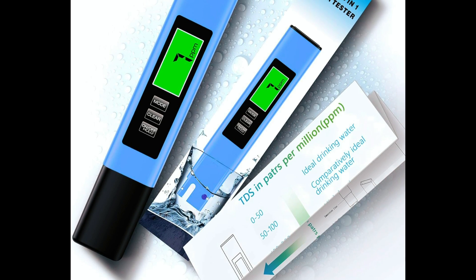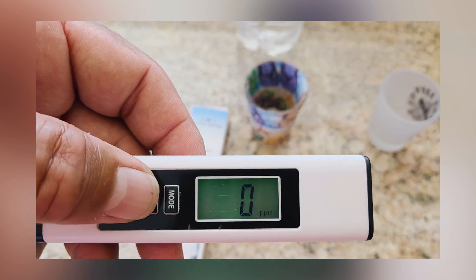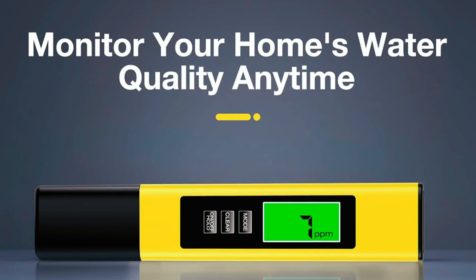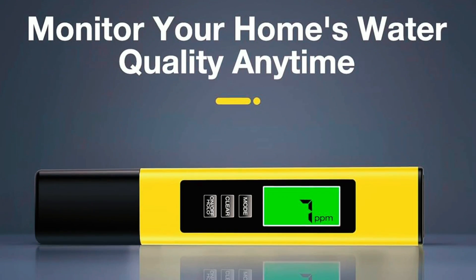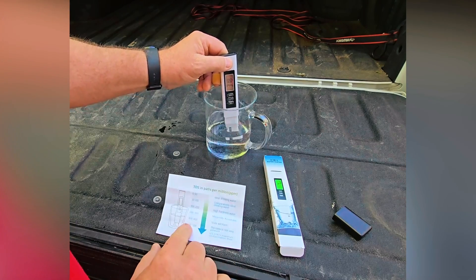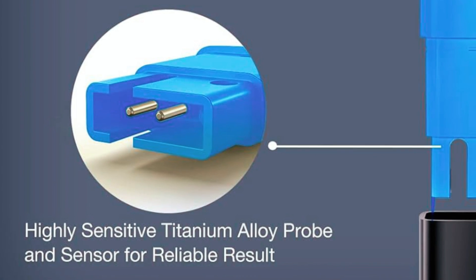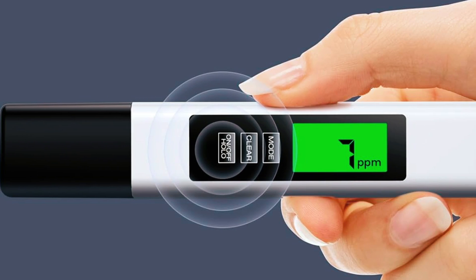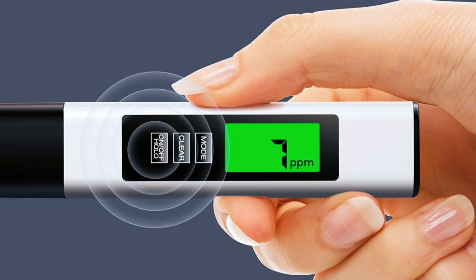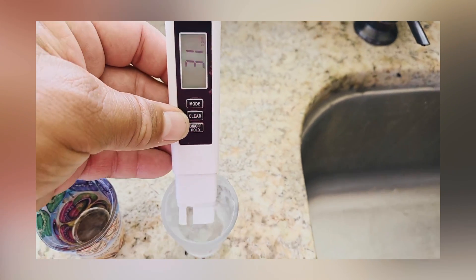We begin with the 2024 all-new 4-in-1 TDS meter digital water tester, a compact and highly capable tool that combines four functions in one device: TDS, electrical conductivity (EC), and temperature in both Celsius and Fahrenheit. With a measurement range of 0 to 9,990 parts per million, it delivers precise readings using a high-quality titanium alloy probe. This tester features a large backlit LCD screen, which makes it easy to read in both bright and dim conditions.